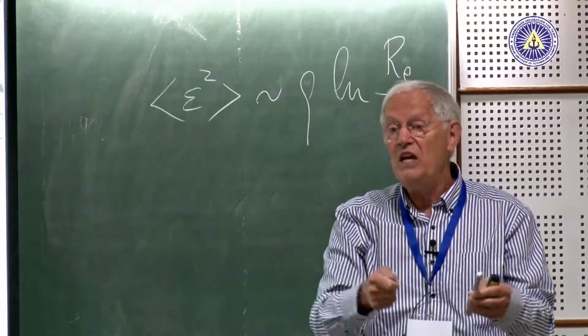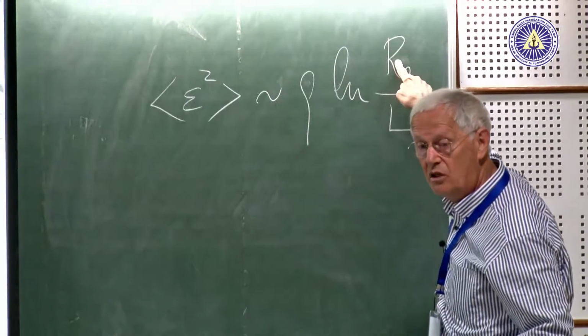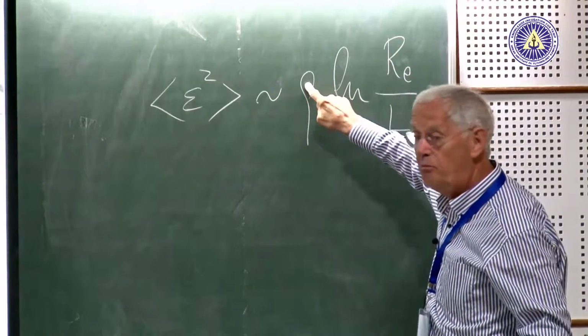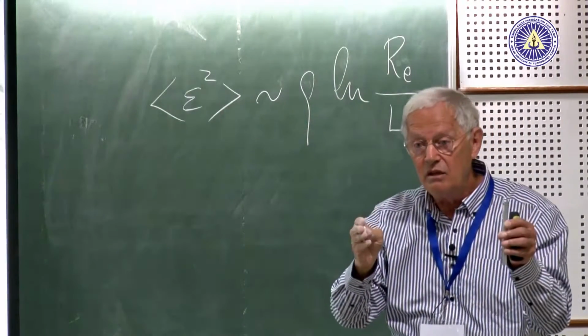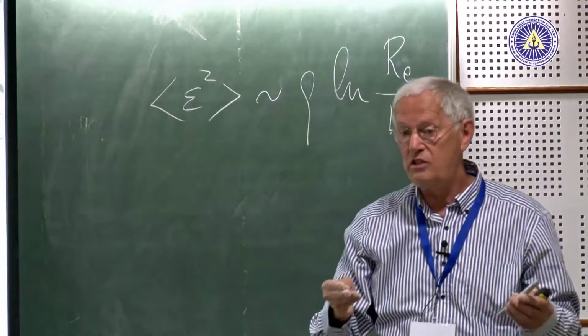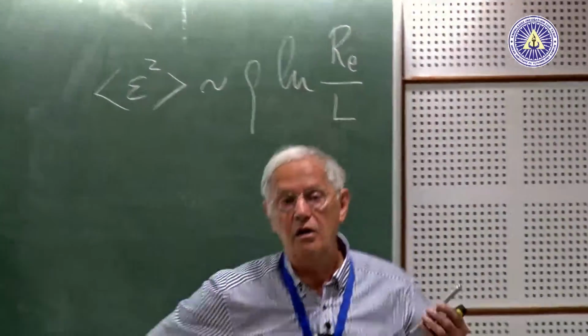If the screening is weak and Re is large, it can be an order of magnitude larger, then you need a much smaller number of dislocations to give you the same breadth. So the breadth alone is not sufficient. Any questions regarding this? Okay, later we can come back.